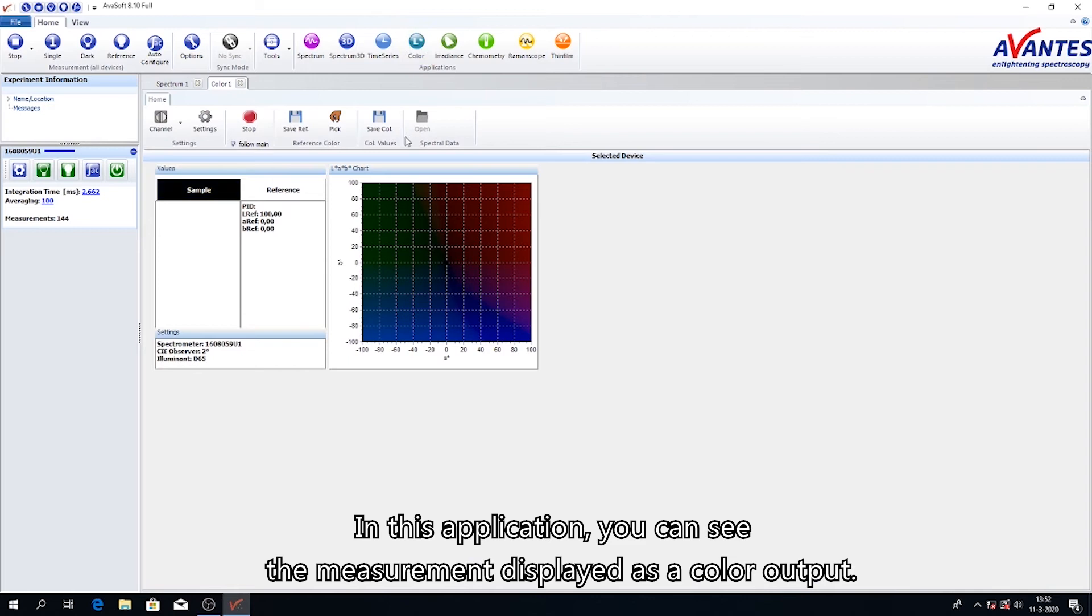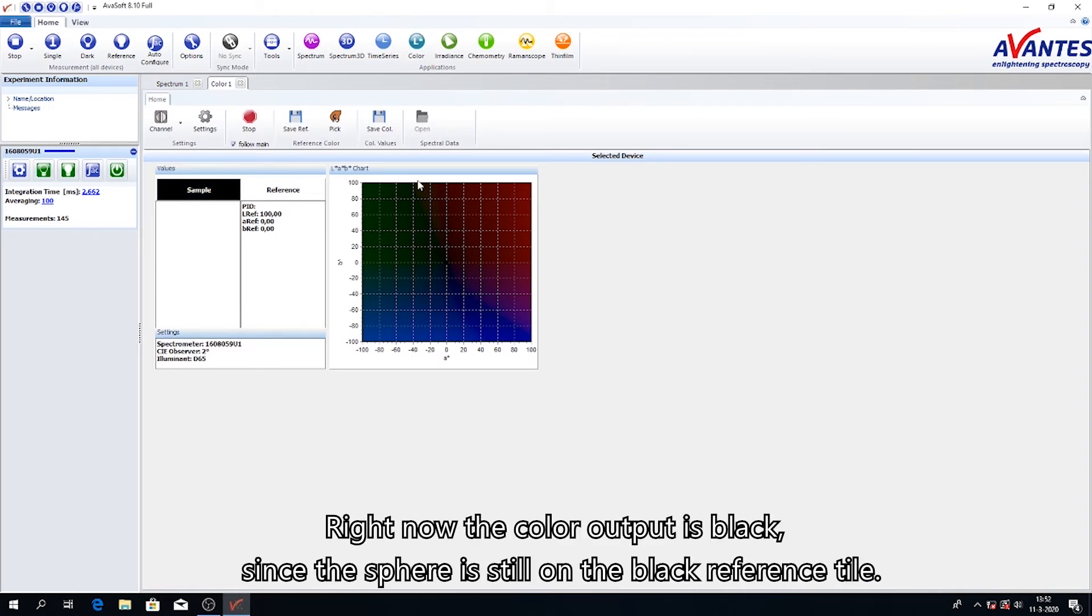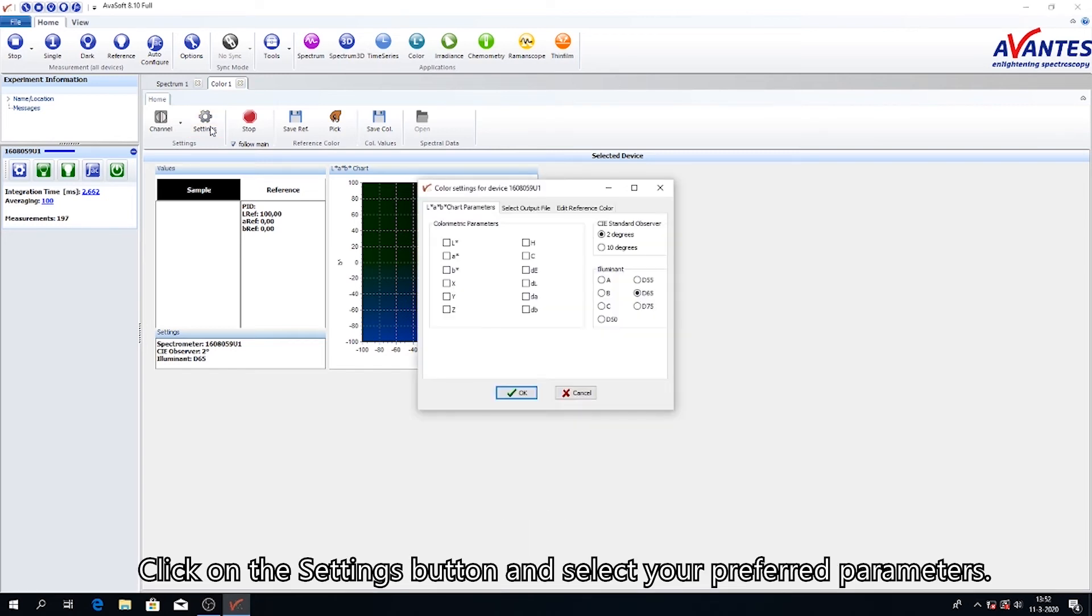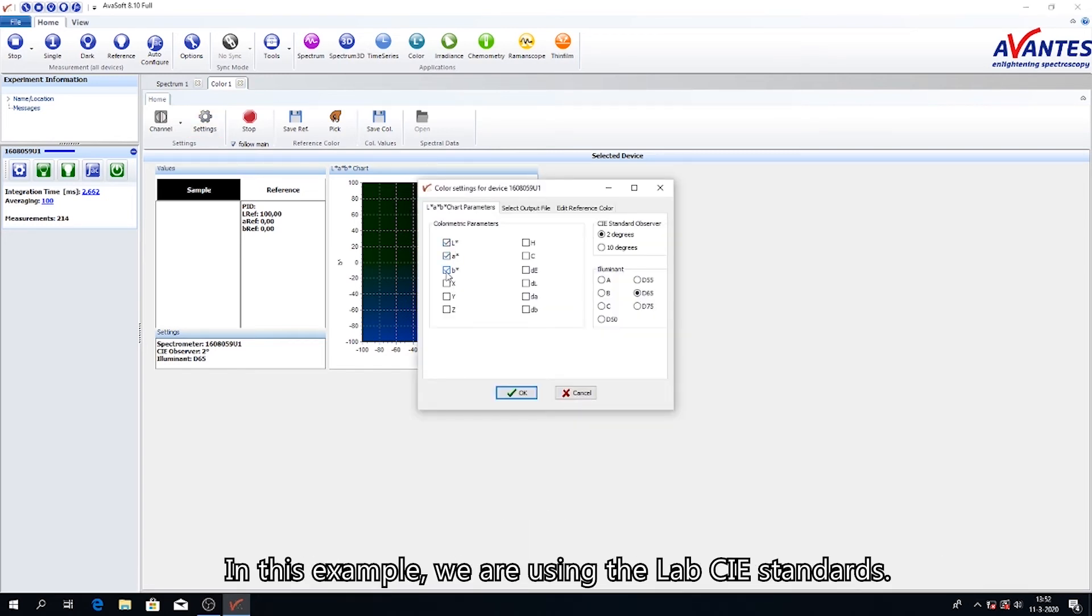In this application, you can see the measurement displayed as a color output. Right now the color output is black since the sphere is still on the black reference tile. Click on the settings button and select your preferred parameters. In this example, we are using the LAB CIE standards.